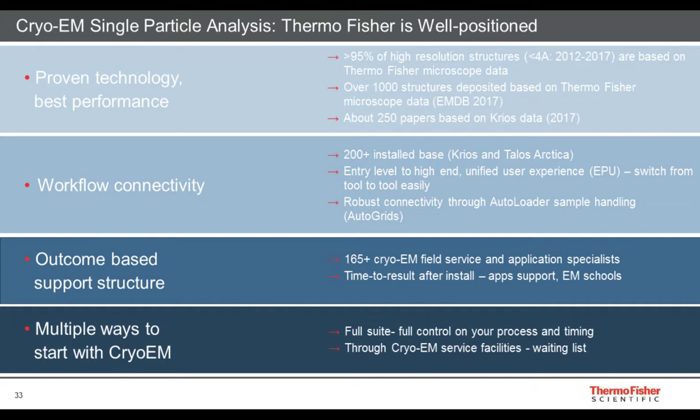Our first question is, do you expect that Cryo-EM will replace X-ray crystallography and NMR? Yeah, that's a good question. I don't expect that this will be the case. As I mentioned in the beginning of my presentation, every technology has a specific place, a specific niche in the spectrum of structural biology techniques.